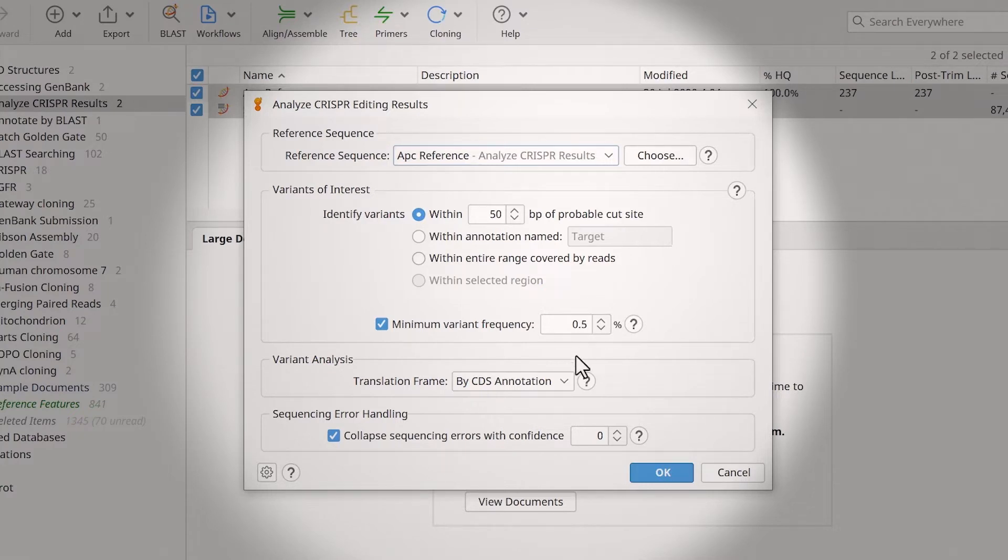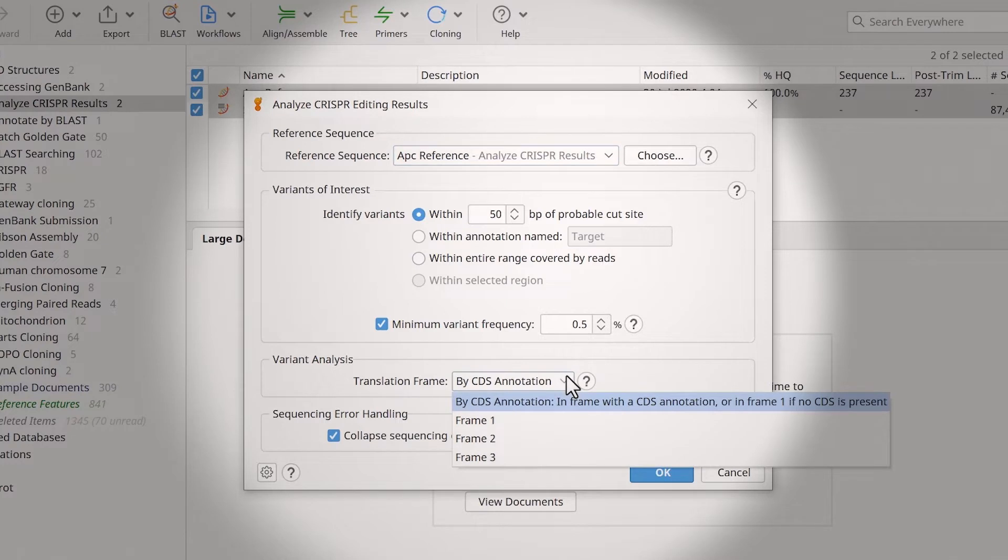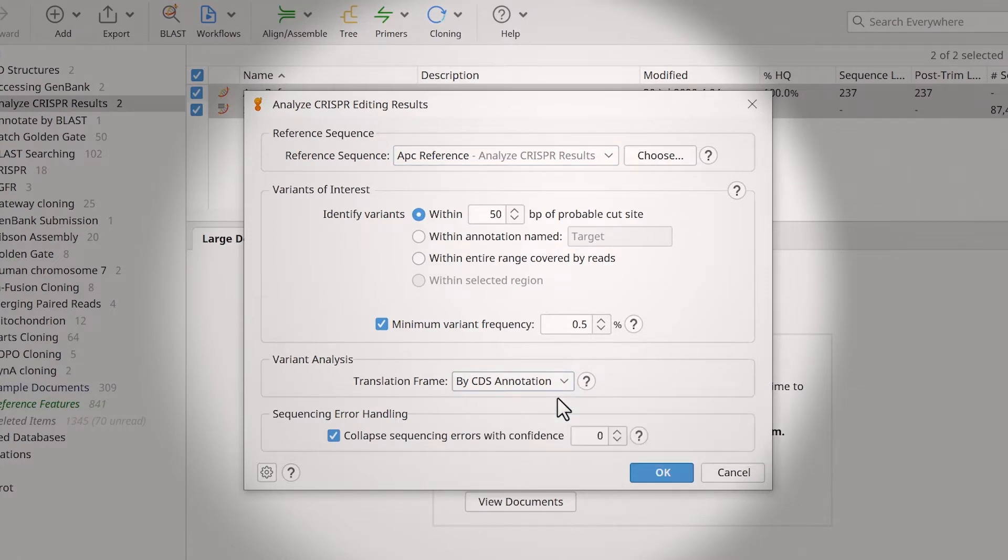It allows you to set the translation frame to use if your reference sequence does not have a coding sequence annotation.